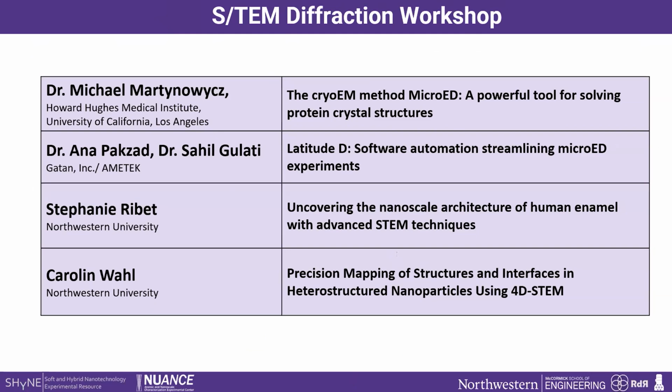Question, Roberto, Vinayak here. Hey, dynamic range, can you tell us if this pixelated detector, especially when you have higher order Laue zone at 0, has a large intensity difference? So maybe if you and or Anna could make some comment, that would be great.